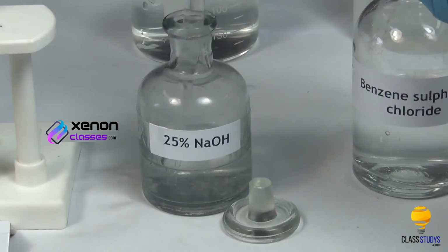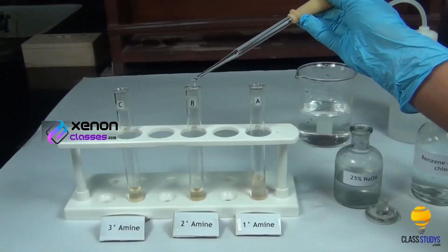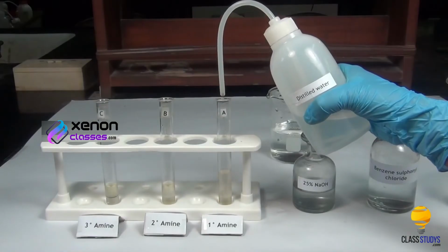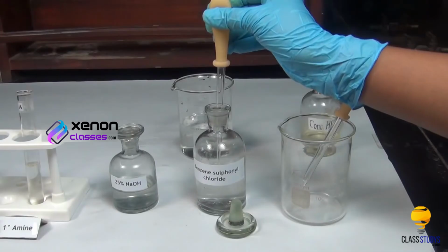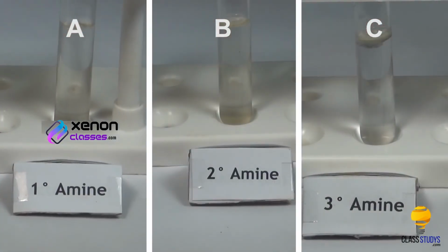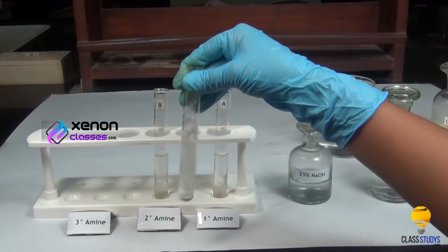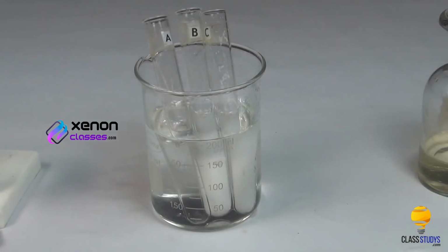Using a dropper, add a small quantity of 25% sodium hydroxide solution to test tubes A, B and C. Now, add a small quantity of distilled water to each test tube. Using another dropper, add a small quantity of benzene sulfonyl chloride solution to each test tube. Shake the mixture in each test tube for some time. Cool the test tubes in a beaker containing water.